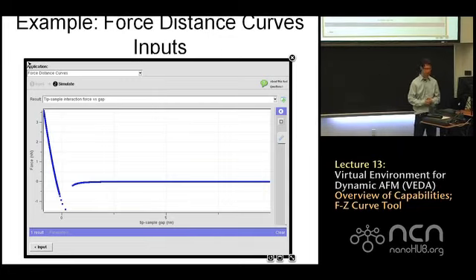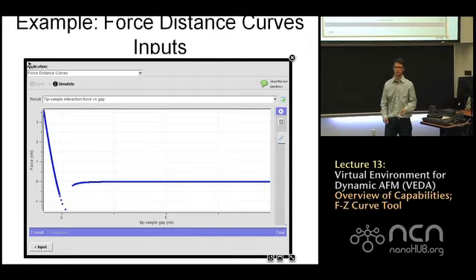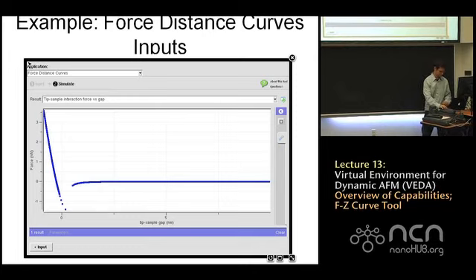Okay, you probably remember what the force versus gap curve looked like when we used the force viewer tool to display it. You'll notice that there's a gap in our curve. We come along, and all of a sudden there's missing information.